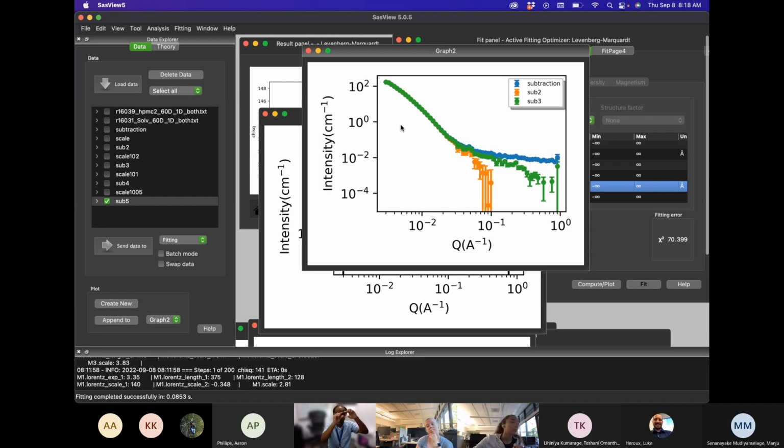That means it could be a rod, right? Because there seems to be a slope leading up to the point where the orange is. You could test that. When you subtract, you just put a power law of 1 and see if the power law 1 matches. That gives you some feel. Okay, maybe it's there.